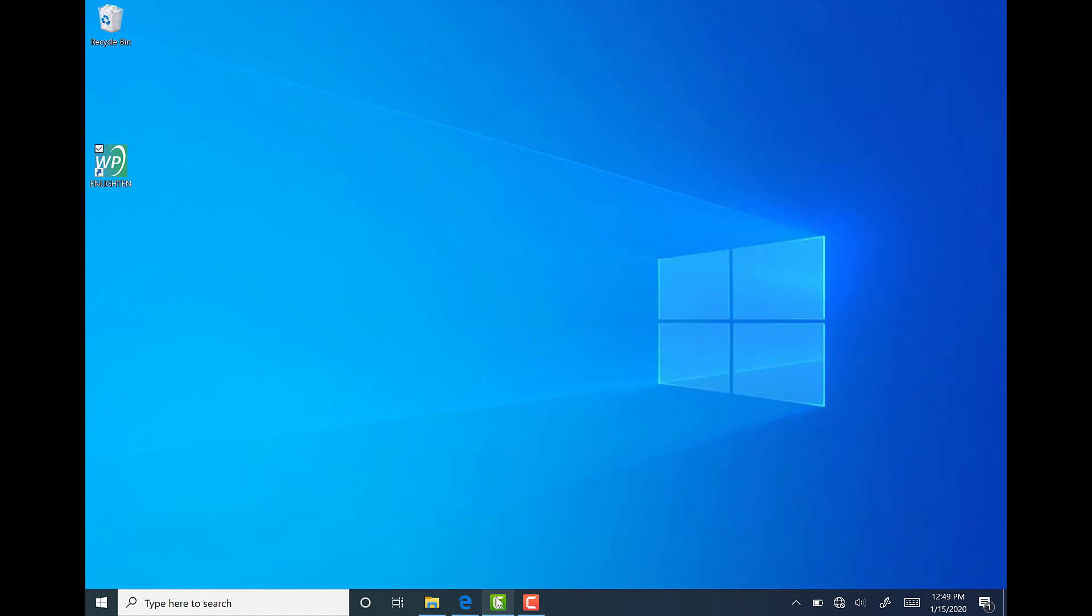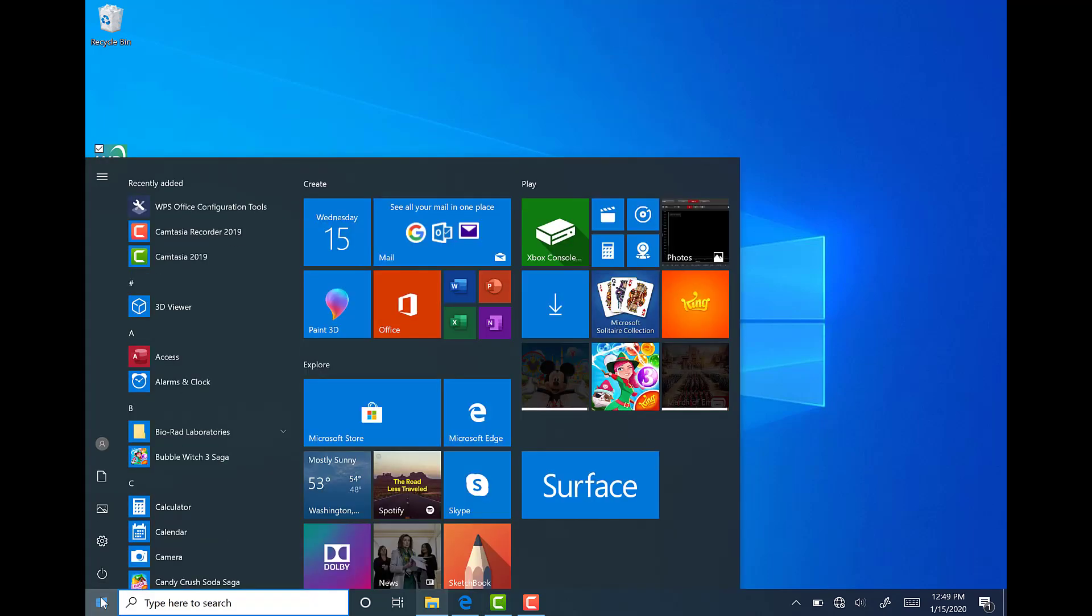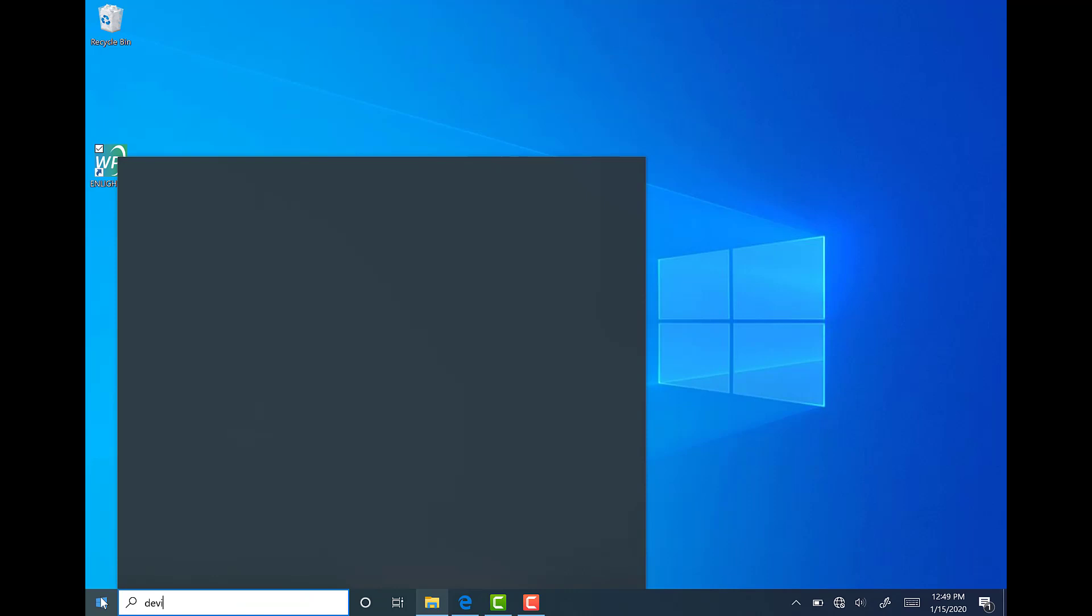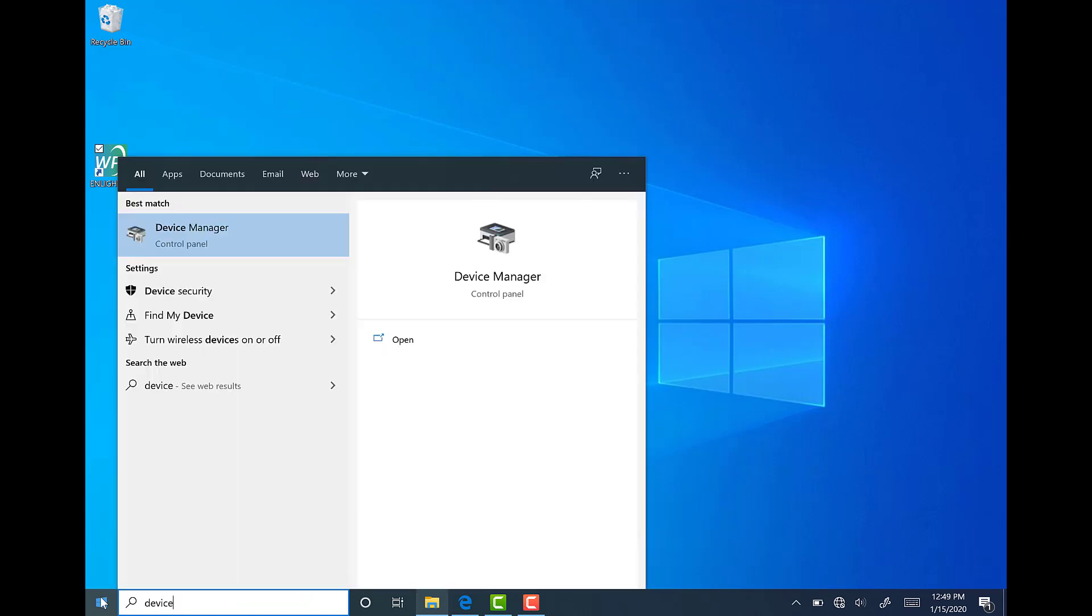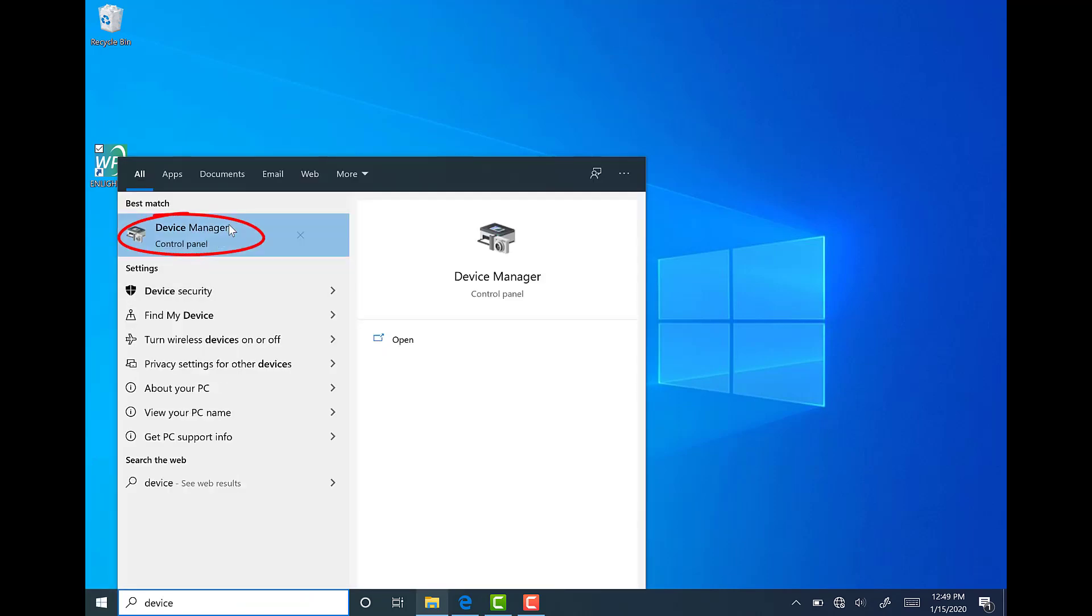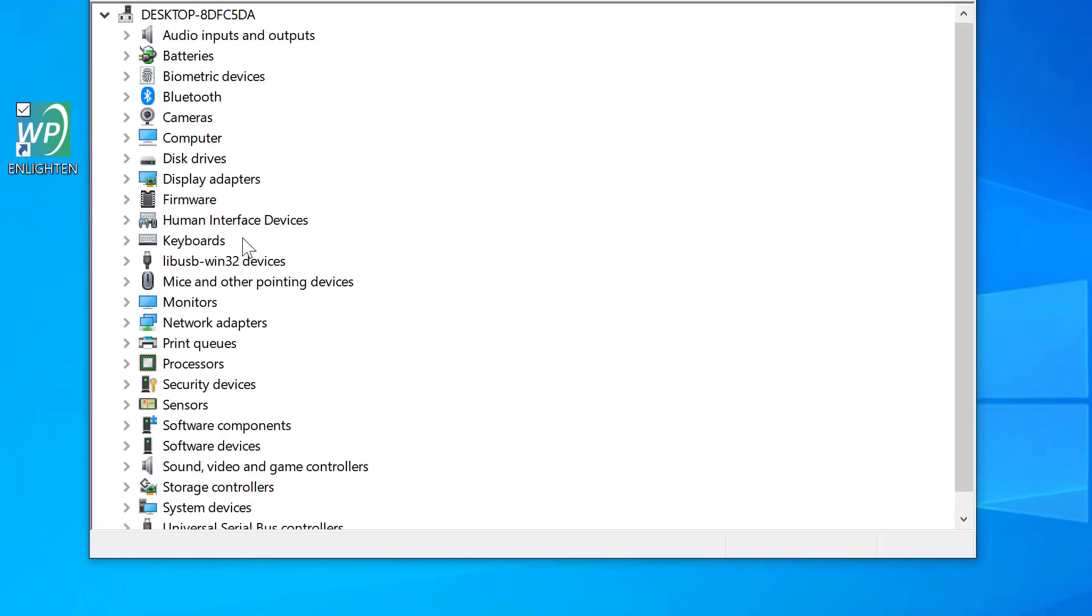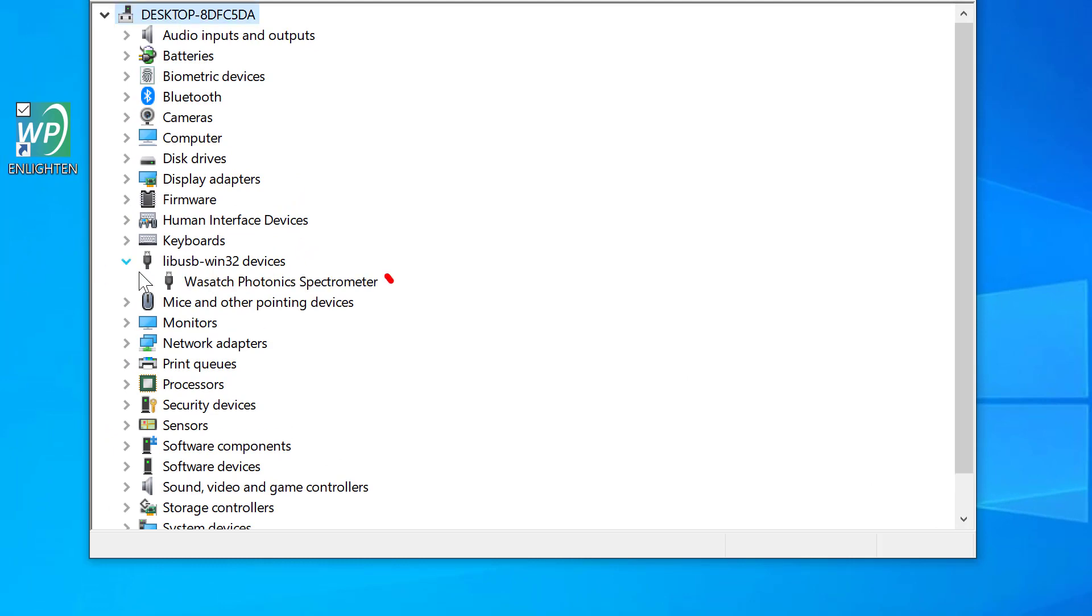To make sure your spectrometer is properly connected, listen for this sound after the USB cable has been connected to the computer, laptop, or tablet you are using. If you miss this sound or just want to triple check your connection, go to the start menu and find your device manager. Locate the LIBUSB folder and expand it to see that Wasatch Photonics Spectrometer is listed.